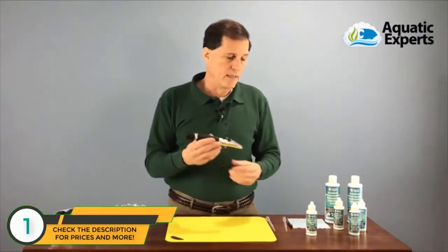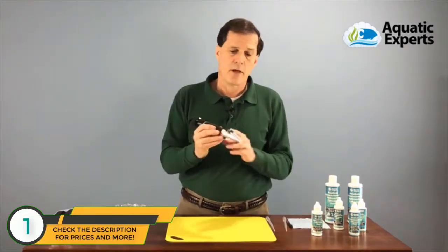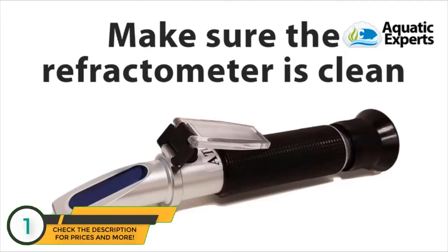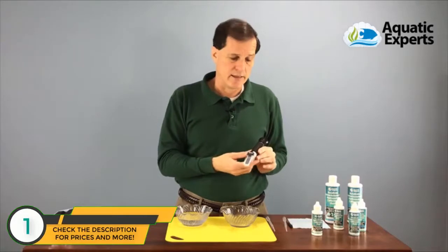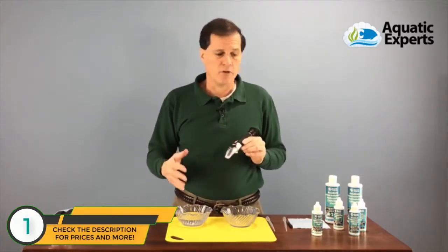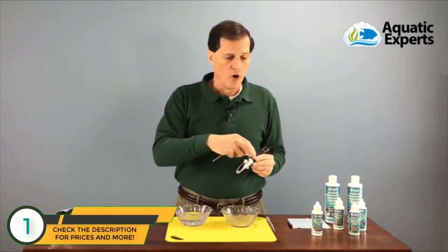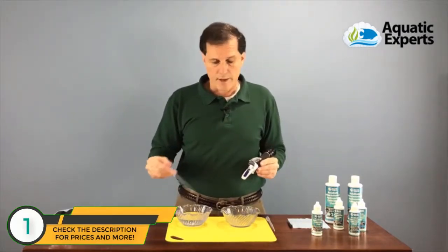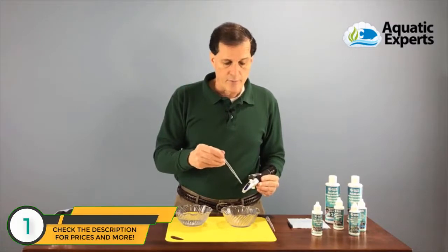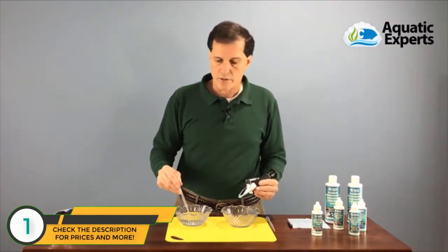Before we begin with the calibration solution, I want to clean off my refractometer from my last use to make sure there are no salt deposits or dust. I'm going to use distilled water — or the purest water you have, like reverse osmosis DI water. I'm going to open the cover, take some water with my pipette, and rinse off my prism and cover to make sure they're clean.